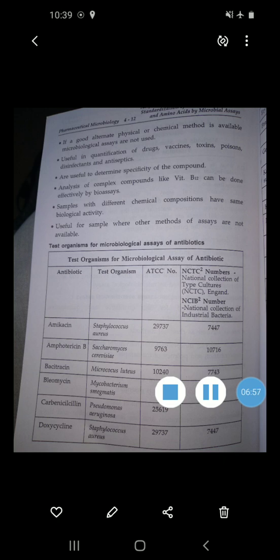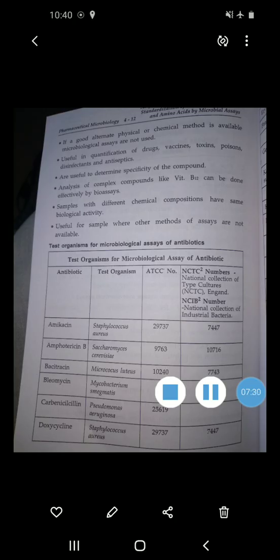First, they depend upon the growth of microbial culture in a uniform solution of the antibiotic in a fluid medium that is favorable to its rapid growth in the absence of antibiotic. The advantage is that the incubation period required for the growth of the test organism is short. Then the disadvantages over the cup method. First disadvantage: this assay is affected by the presence of solvent residue or other inhibitory substances.